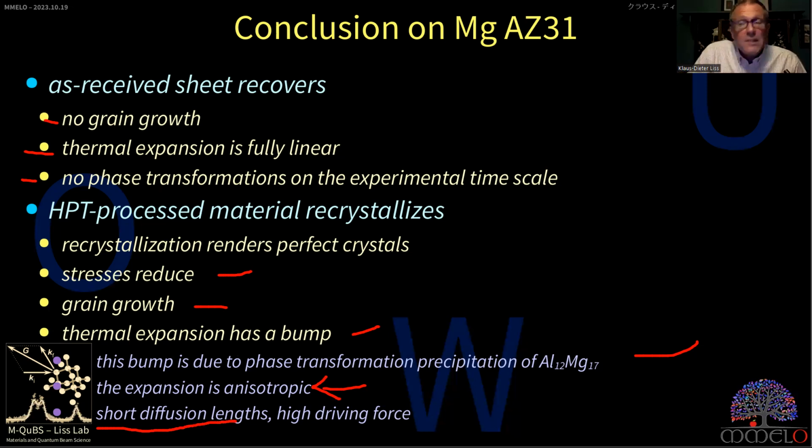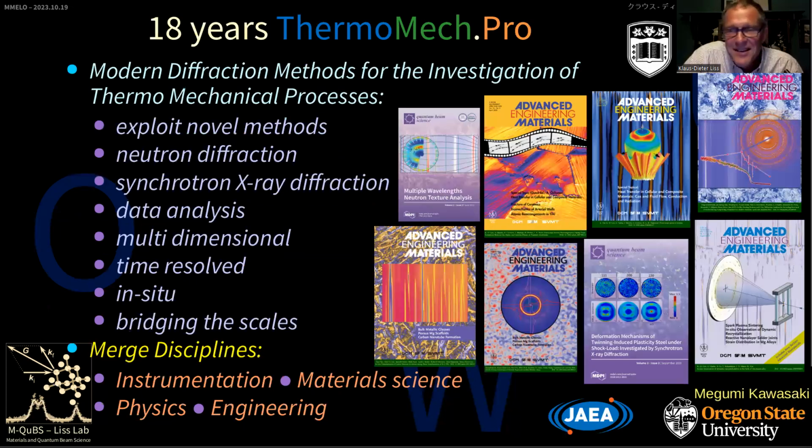Okay, I was confused at the beginning because this is my introduction here. This is the introduction I wanted to give at the first slide, namely that we work here with modern diffraction methods and we exploit neutron and synchrotron methods that you have seen already, and we do a lot of studies in situ and time resolved and multidimensional with the detectors. So I threw myself a little bit into the cold water because I messed up my slides. I really apologize for that.